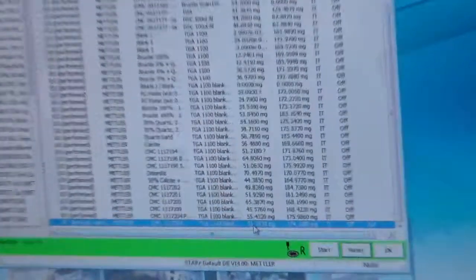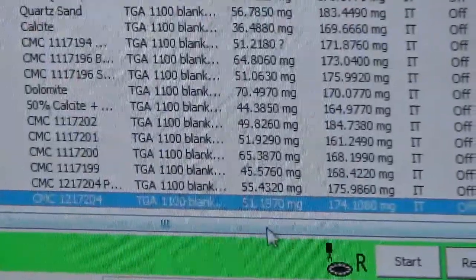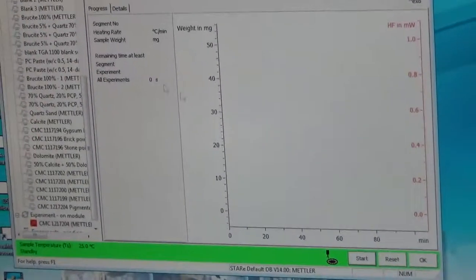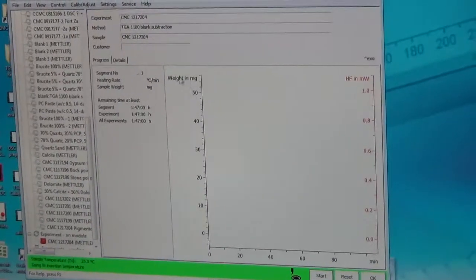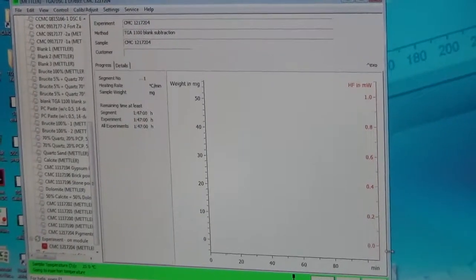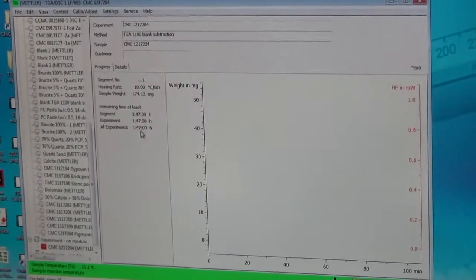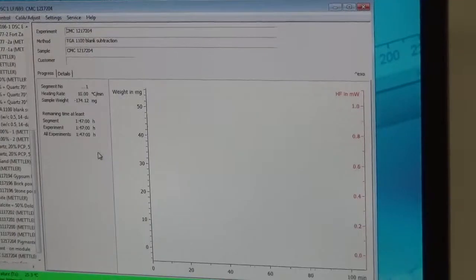Here is the sample weight — it calculated the sample weight. So now we just say start. Once we say start, the experiment screen opens. It shows the weight in milligrams versus minutes — how long it will run. It says it's going to run 1.47 hours, about an hour and a half to two hours per sample.